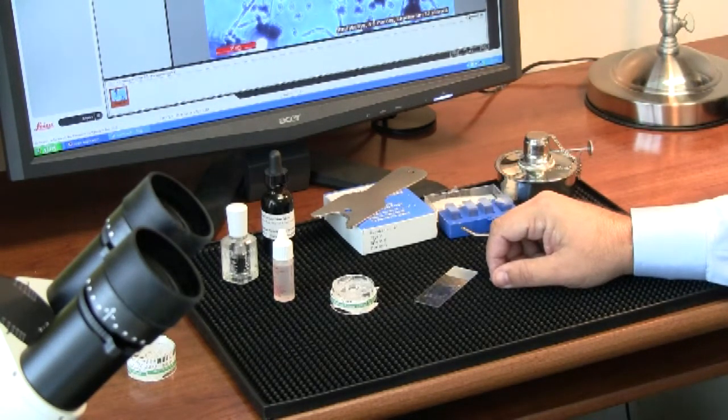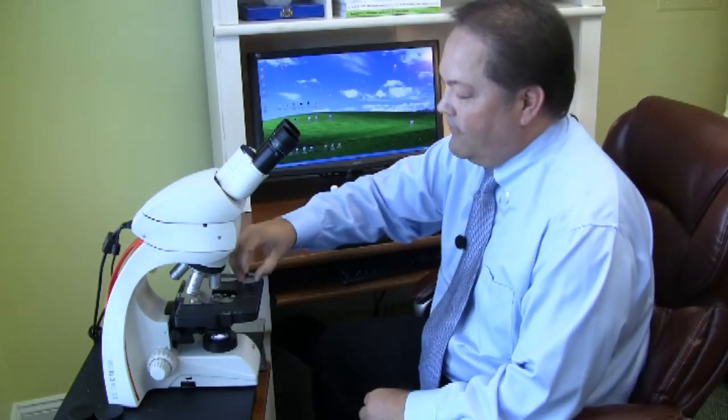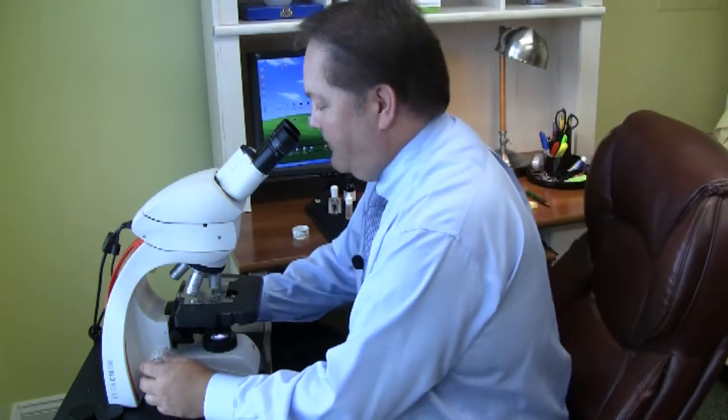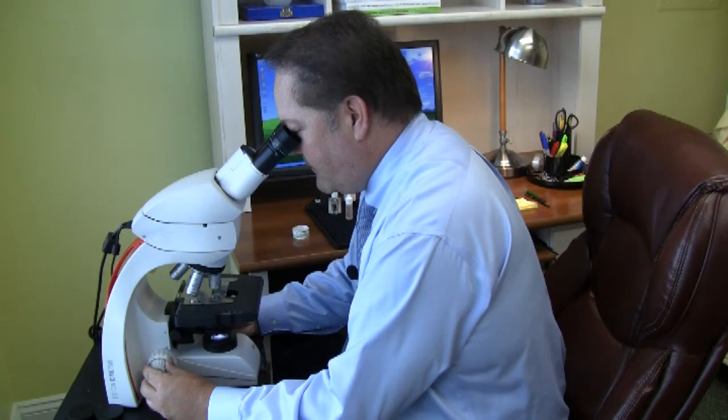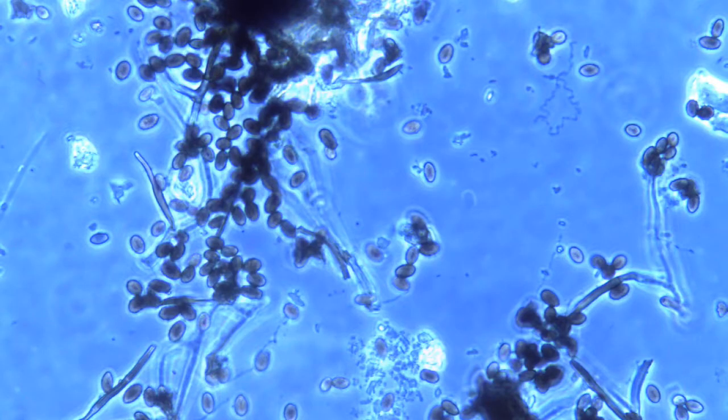With that we're ready to look at the slide under the microscope. Now that we have the spore trap sample mounted we can look at it under the microscope. We have the image there and we'll pull it up on the computer so that you can see it and have a look at what Stachybotrys looks like.